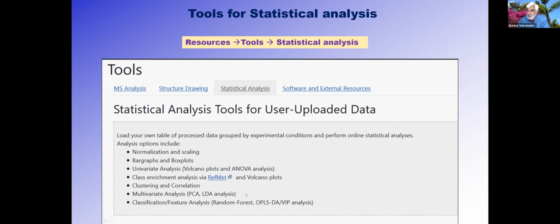In fact, many of you are familiar with principal component analysis. It's a way of reducing your dimensions. Imagine you have 1,000 lipids and you've got 10 different factors or conditions, and you've got essentially a matrix of 1,000 by 10. That's a huge dimension for you to explore to see what is significant. Can we figure out a strategy to group these into some simple way of classification, classing them with variance as a criterion? And I'll tell you more about it as we go along.